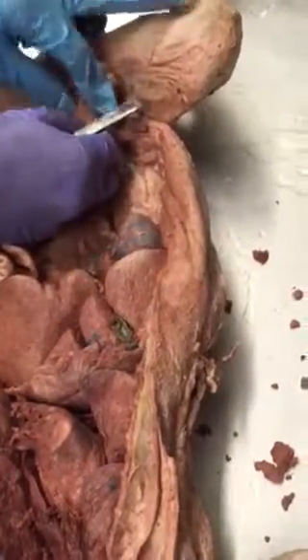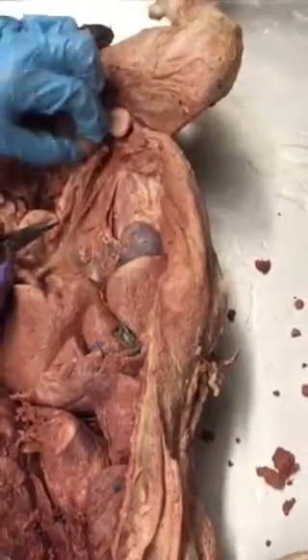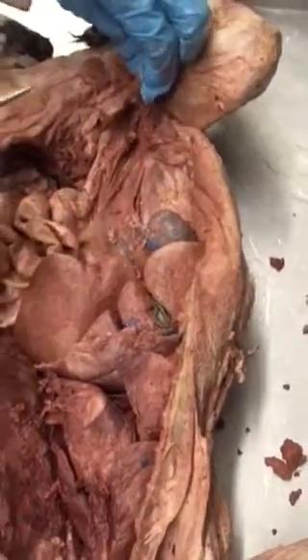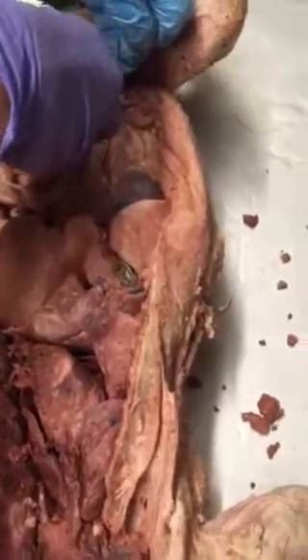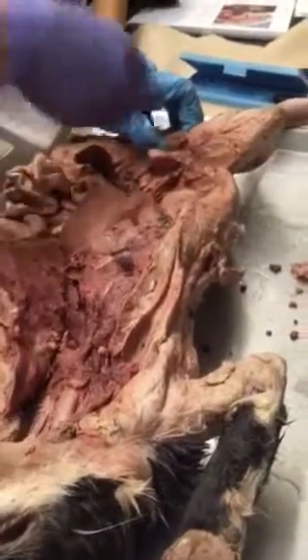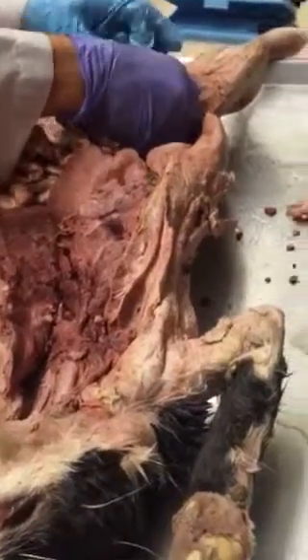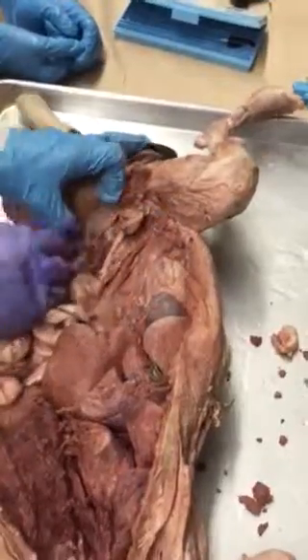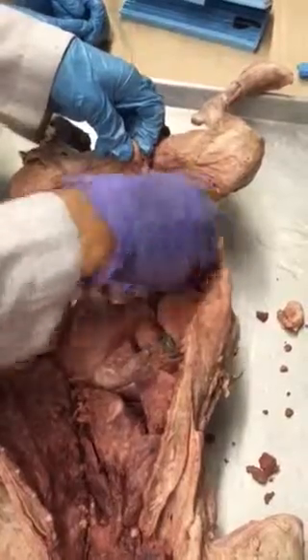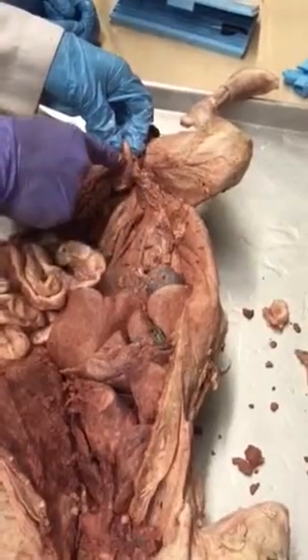to our urinary bladder, which is right here. So there's a couple fat deposits here around the urinary bladder. If it makes it easier for you, you can cut those off. Okay, so this one, it'll be bigger or smaller depending on the cat. Yeah, this is the bladder. Okay. All right, so you can see our ureter comes down and comes in here to the urinary bladder.